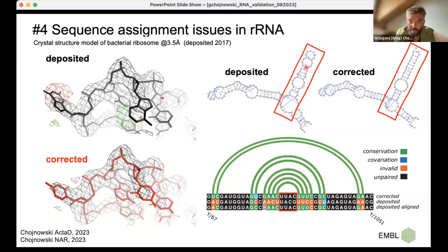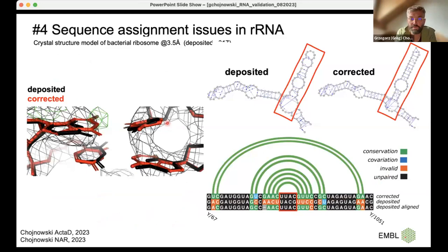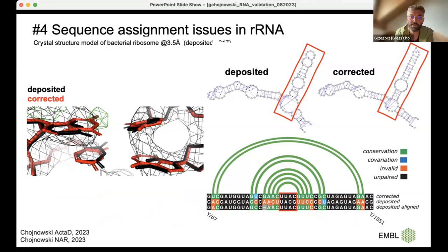After fixing the sequence problem, the obvious density fit issues disappear and the overall quality of the secondary structure improves, with many more base pairings now present as expected. The simple sequence alignment of the deposited sequence variant versus the corrected one shows exactly what Check My Sequence identified — the missing residue it suggested corresponds precisely to the difference between the wrong and correct sequence variants.